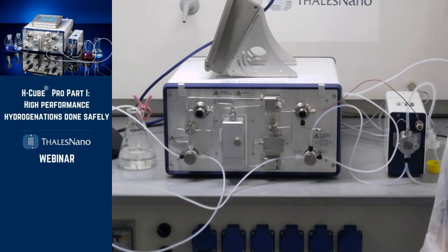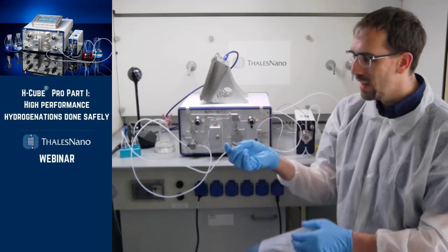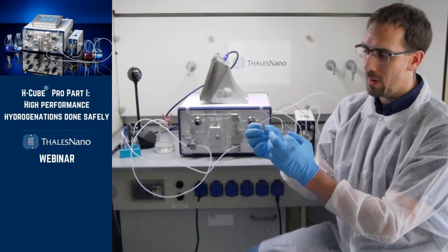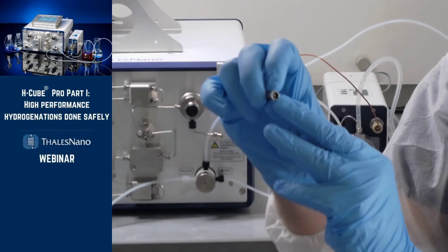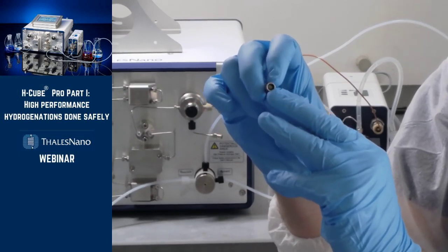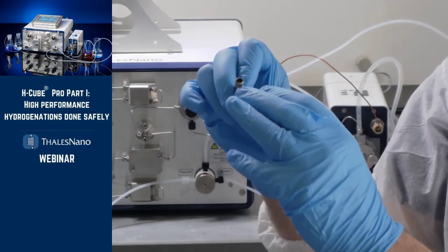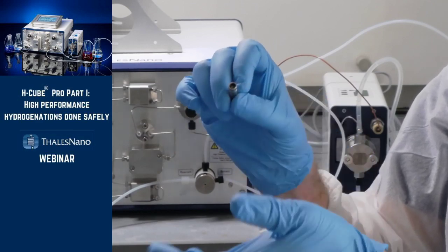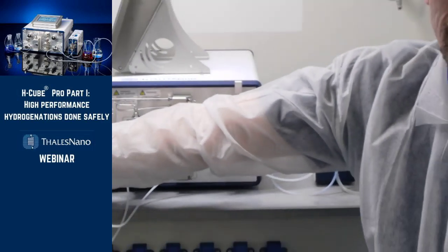How can I pack a cartridge by myself if I already have catalyst? As I said, you need to use the CatCart Packer to seal the cartridges. What you would typically receive is, you buy one of these cartridges, but on the top of the cartridge you wouldn't have the seals installed. So you just place your catalyst inside, you put in the filters or membranes, and then you put in the Teflon seal and use the CatCart Packer to close it. It's a fairly simple process.